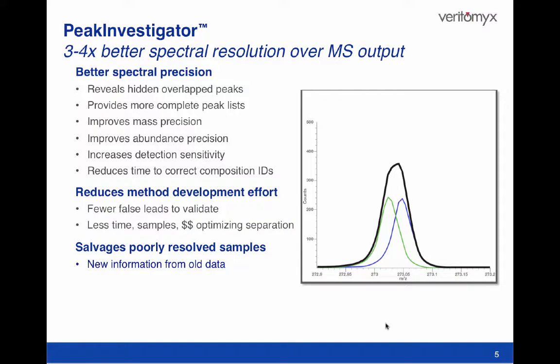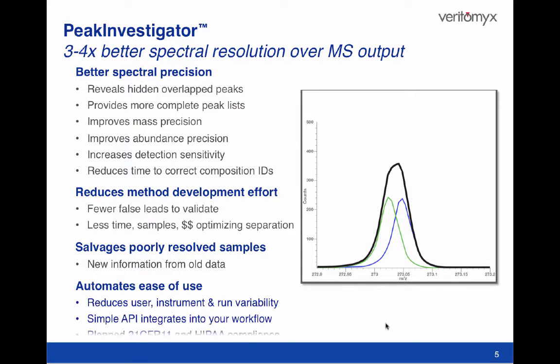Detecting and deconvolving previously hidden peaks also opens up a valuable opportunity to salvage new information from old data. PeakInvestigator is highly automated, reducing variability between users, instruments, and runs.